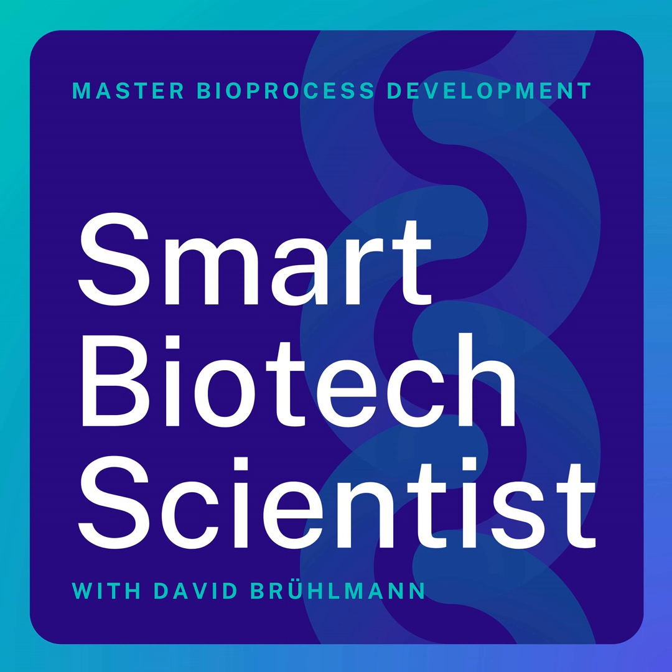Let's smarten up biotech. And now let's make it very practical, Payar, and break it down in a few simple steps. So for someone who wants to develop an adherent cell culture, how should they start and what should they do to succeed? By adherent cell culture, I'm talking about microcarriers, particularly when you have a vision of scaling up. Let's put it that way.